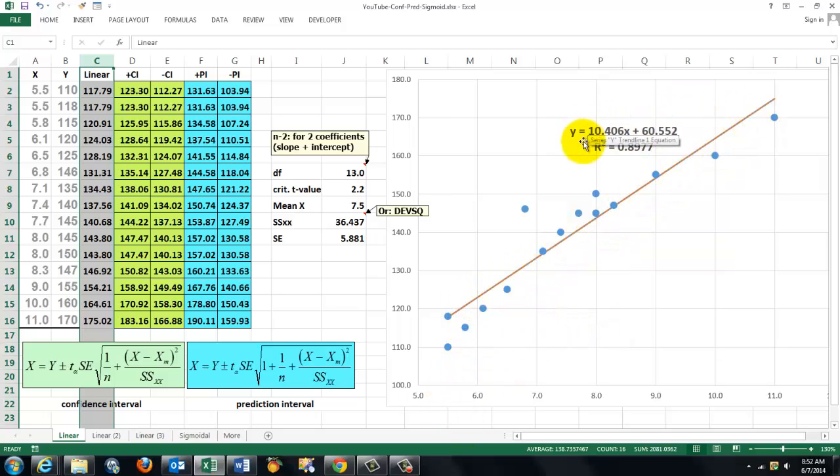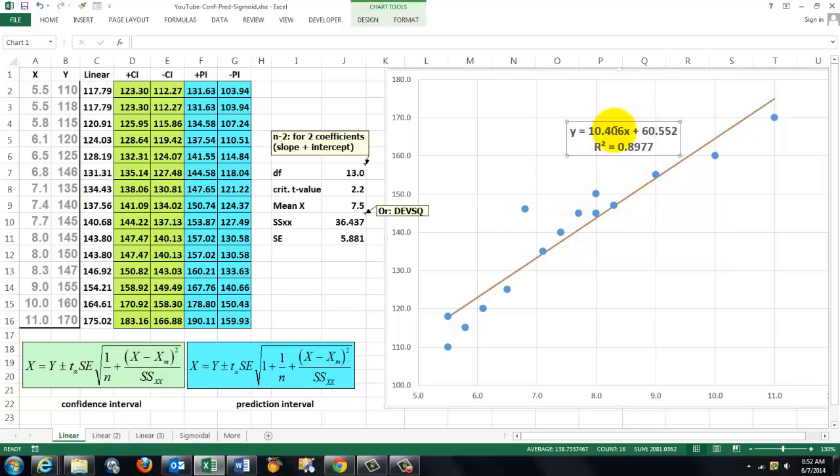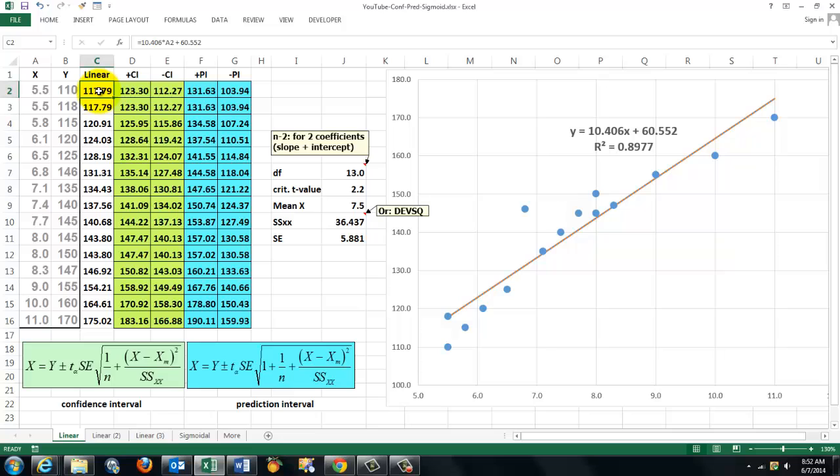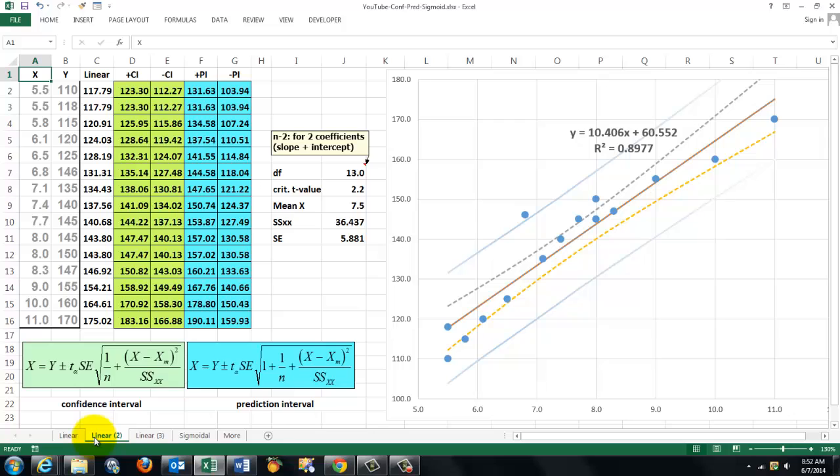You can either do that with a curve in Excel and then use this parameter value, which is the slope plus the intercept, or you can use the trend function. Then we are going to calculate the confidence interval according to this equation and the prediction interval according to that equation. And it's going to look like this very soon.